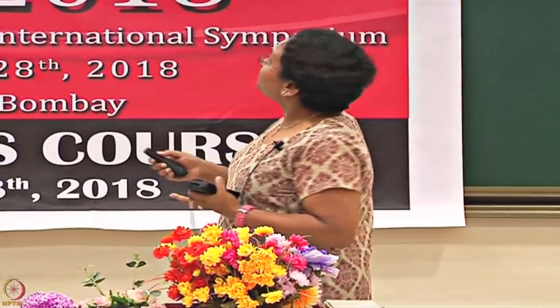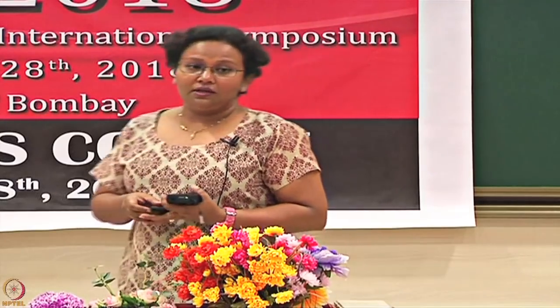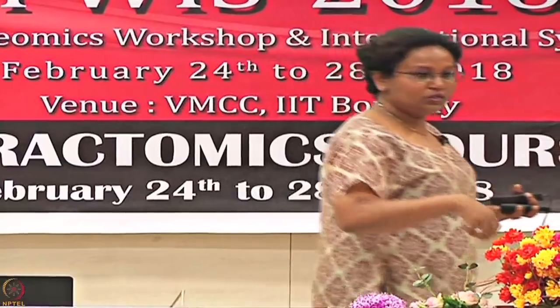Functional groups and the binding activity of the immobilized molecule go together, because if you are using a functional group to immobilize which is actually in the active pocket, then you destroy the activity, and there is no point. So you need to have some information about the functional group that you are using, and that it is not being used to immobilize it on the surface.